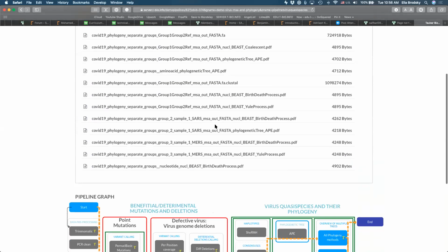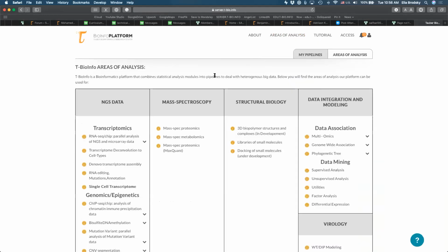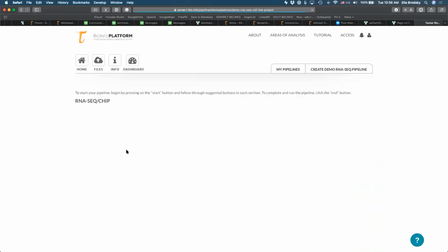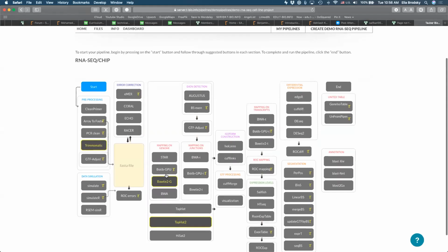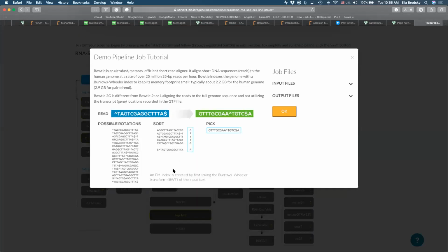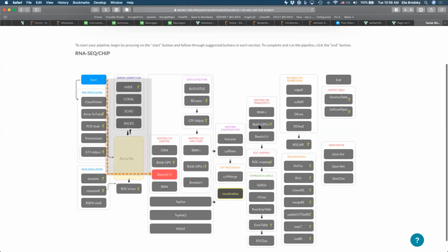Previously somebody asked, how are these tools different from doing this analysis on your computer or on some server? No different at all, apart from the fact that it organizes the analysis into a logical step-by-step process. So you'll see here an explanation of the different steps and what these steps are designed to do. You will also get reference information. How can you understand each algorithm that you are using?